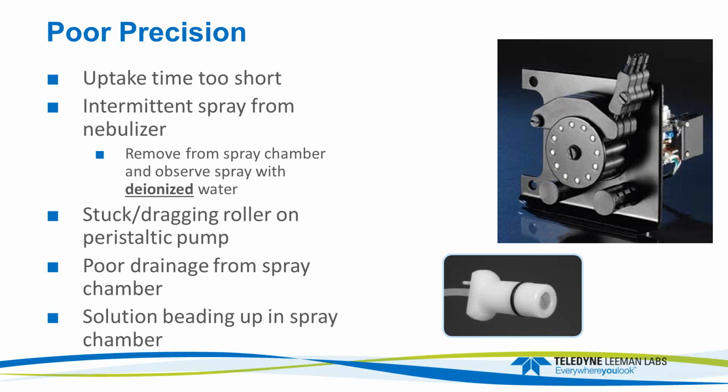Okay. Look at a stuck or dragging roller. I just put my finger on it and see if I can detect it being dragged a little bit slow. If that roller is jammed on the peristaltic pump, you have to be a little careful because it'll drag your finger right into the edge there, and it hurts a little bit. But you can prevent your rollers from dragging and sticking if you just make sure you don't wait for the peristaltic pump tubing to fail before you change it.